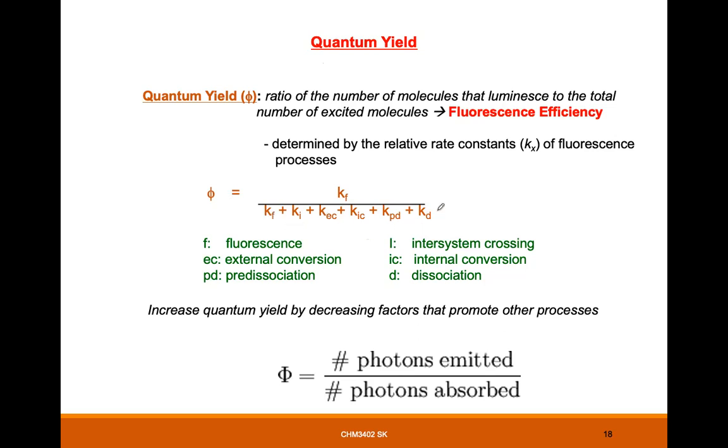Whatever is represented here is the process that is happening during the production of the fluorescence. So no need to worry, because I'm not going to ask you to calculate this. But if you like, synthesize a new compound which has fluorescence properties, you have to calculate the quantum yield in order to quantify how efficient the fluorescence properties of that particular compound are.